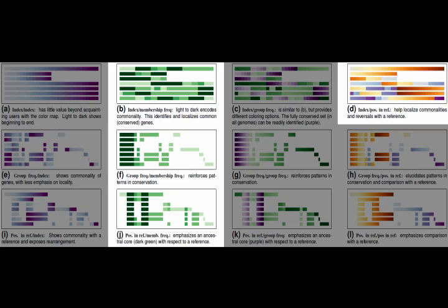Sequence Surveyor employs a variety of color and position mappings to support the exploration of a wide range of questions about the data. This video will highlight a few of these mappings.